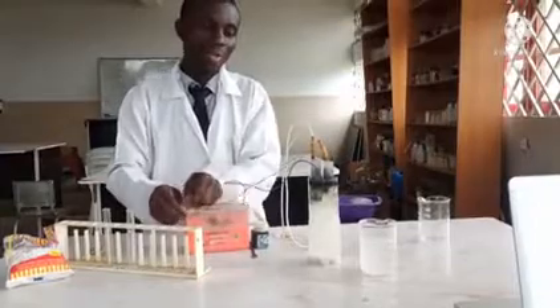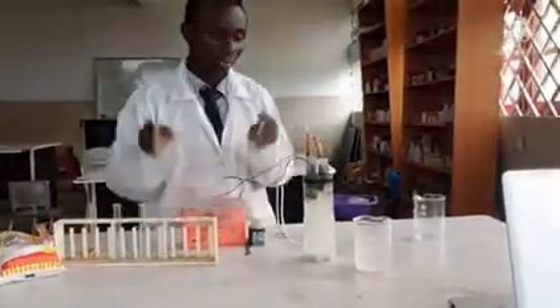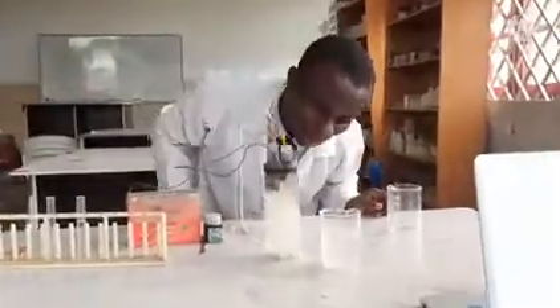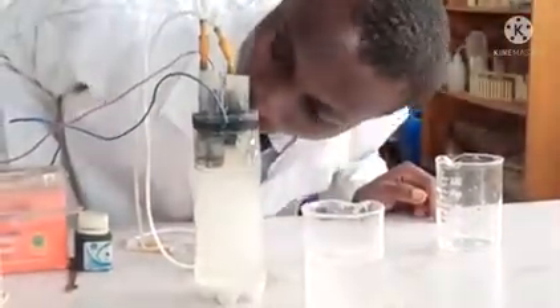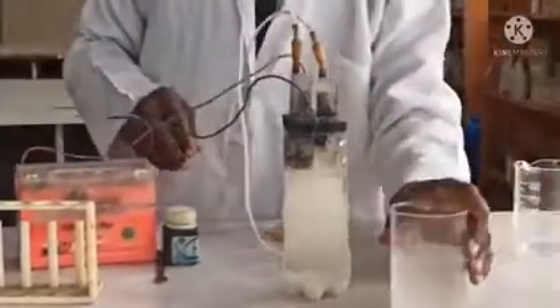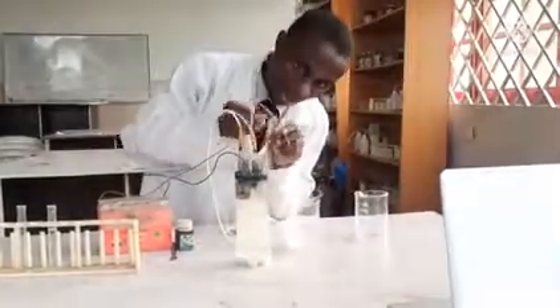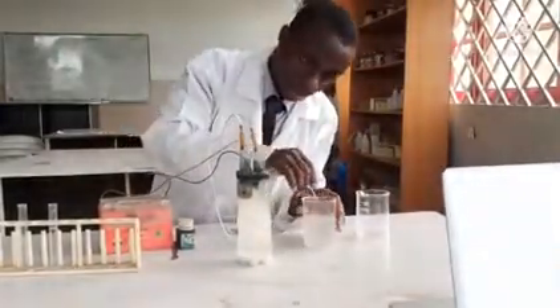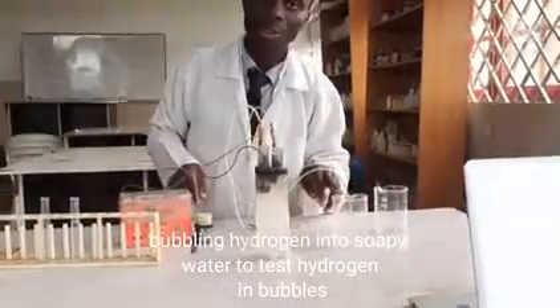The reaction should start immediately. Let me check if it has started — okay, it has started producing gas. What I'm going to do is take the part for hydrogen and bubble hydrogen into this detergent — soapy water solution — because when I conduct the flame test I don't want any uncontrolled exposure.